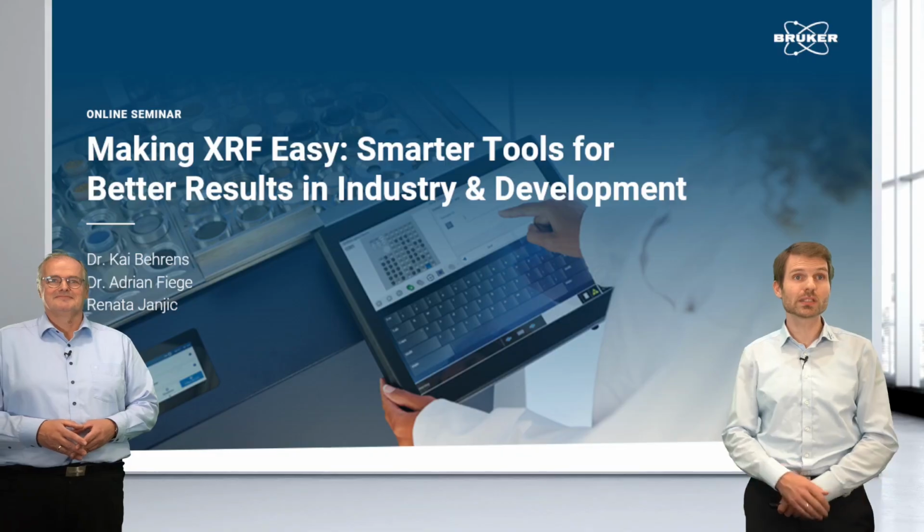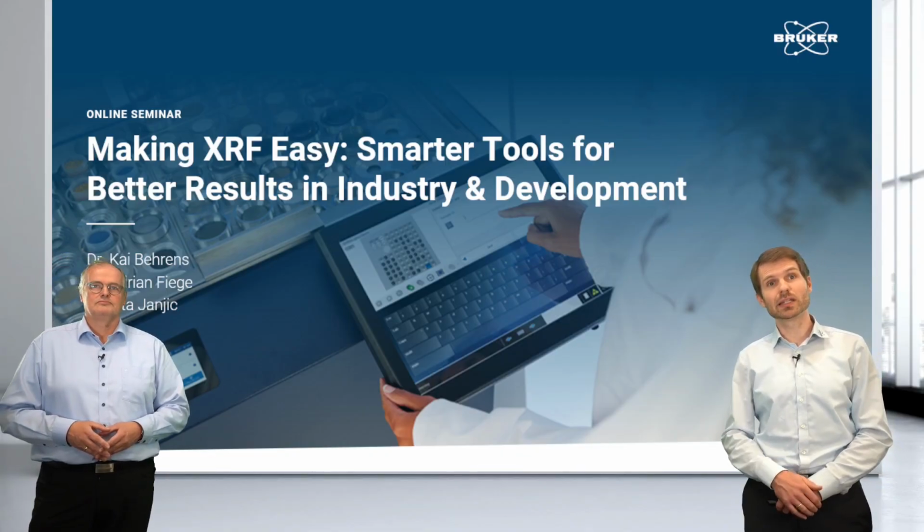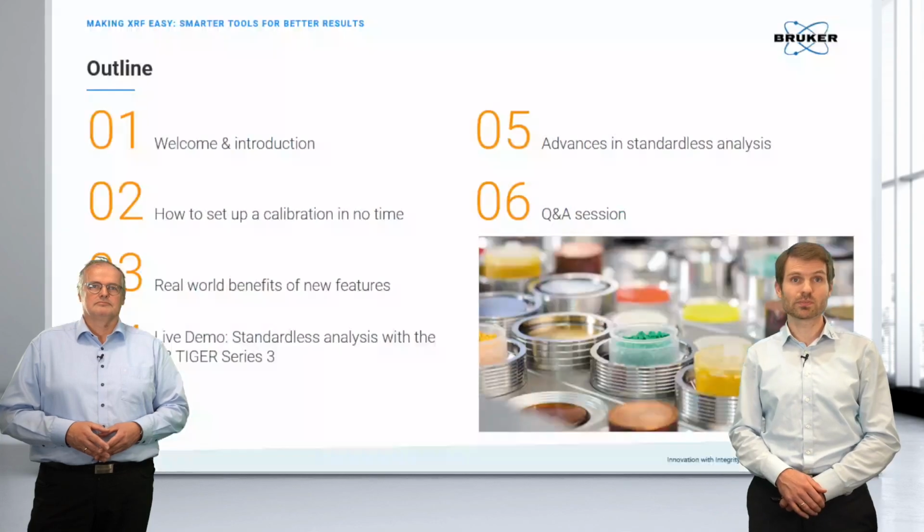Yes, so our topic today is making XRF easy with smarter tools and allowing industry and development to obtain better results even easier than before.